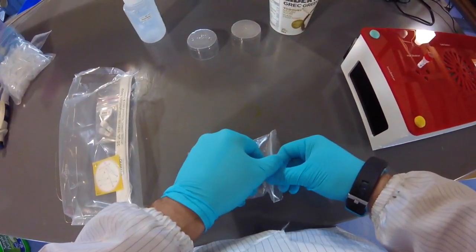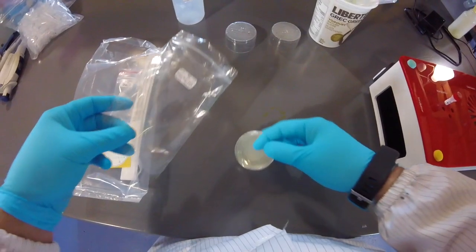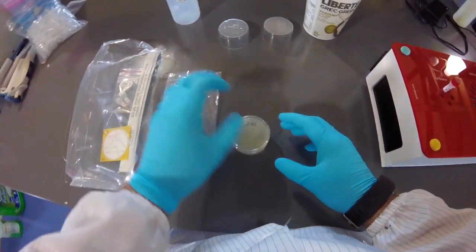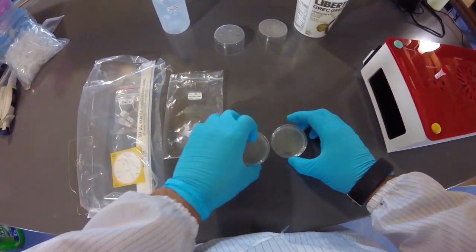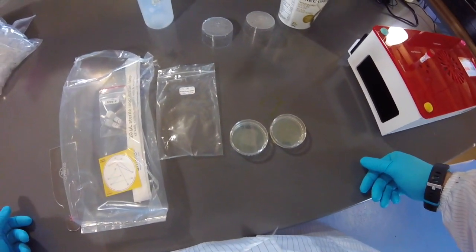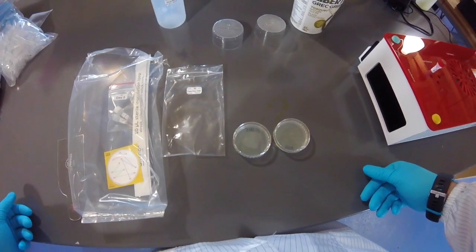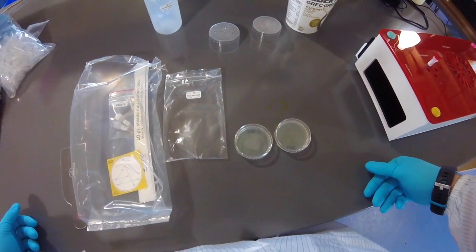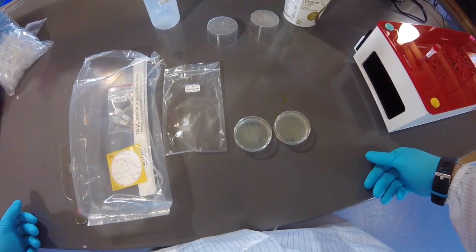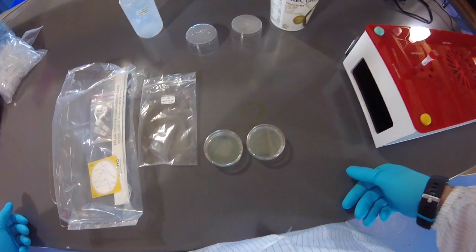And then also on the first day we streaked some blank cells, meaning cells that have not been engineered yet. We streaked them onto the non-selective plate so they could grow. We then put those into the incubator. And then we also did another plate, the negative control plate, which does have antibiotics in it. And we also streaked some blank cells onto that and incubated that as well.